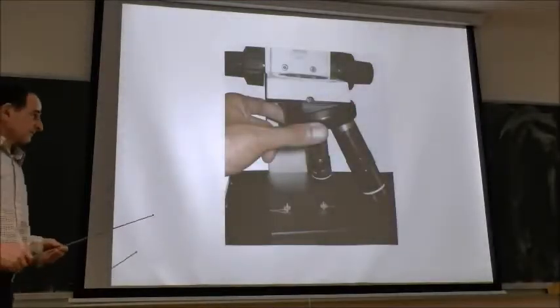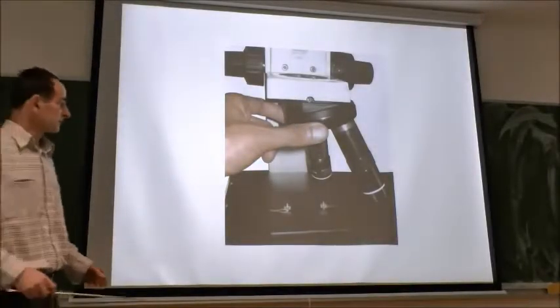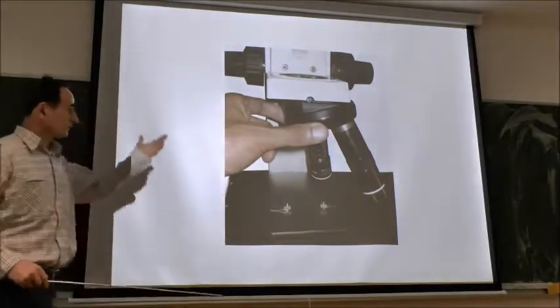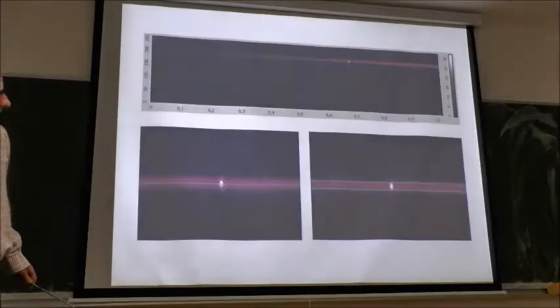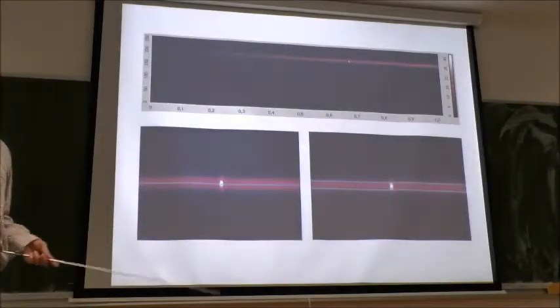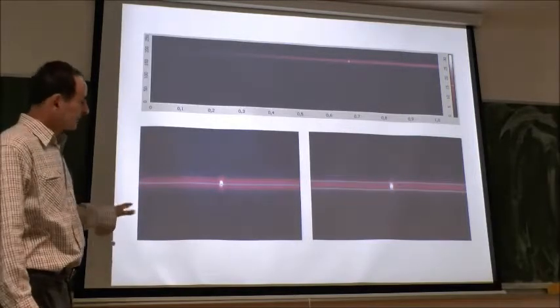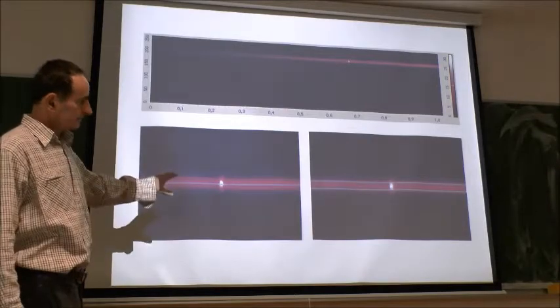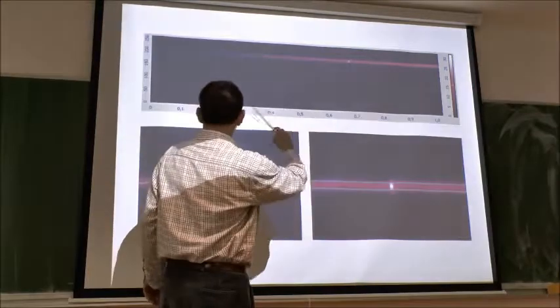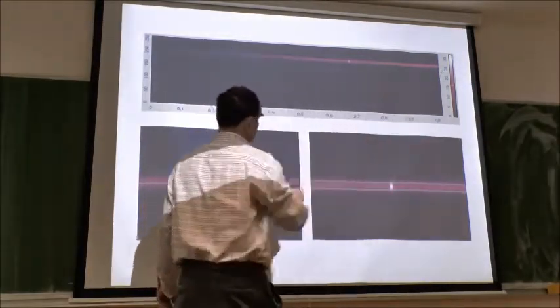Then, how we collect Raman spectra. We simply put our sample on the microstage. It's here. This is an optical microscope, and the instrument would adjust itself. Then you push a button and you get an image of the scattered light on the CCD camera. So this is your first guess. This is the image of the Raman signal.